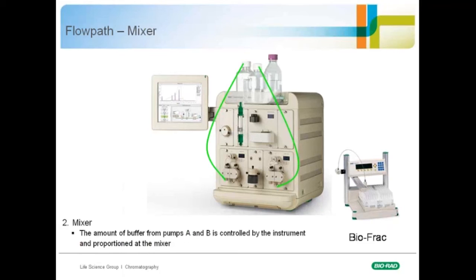Next is the mixer. The mixer is where we're going to proportion the amount of fluid from both pumps A and B into the system and onto the column.